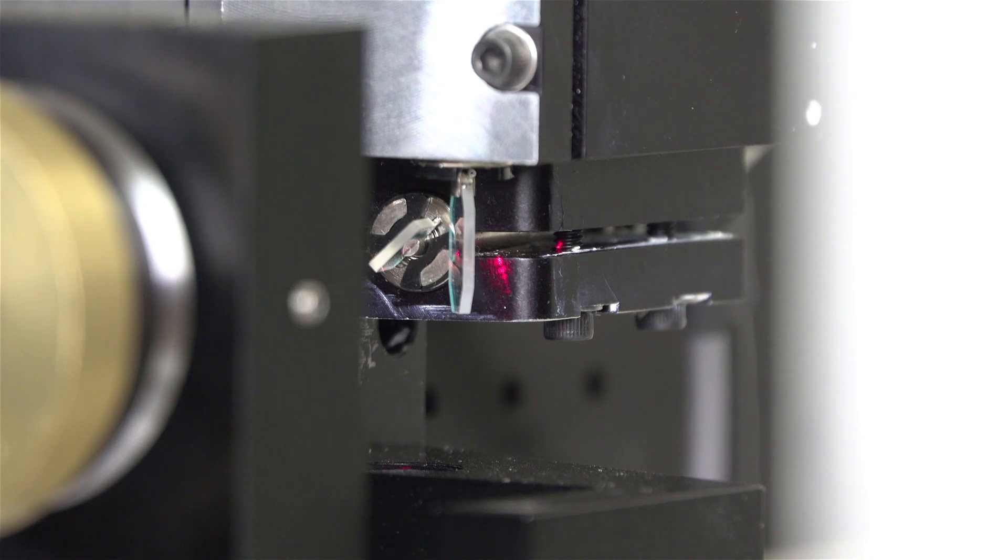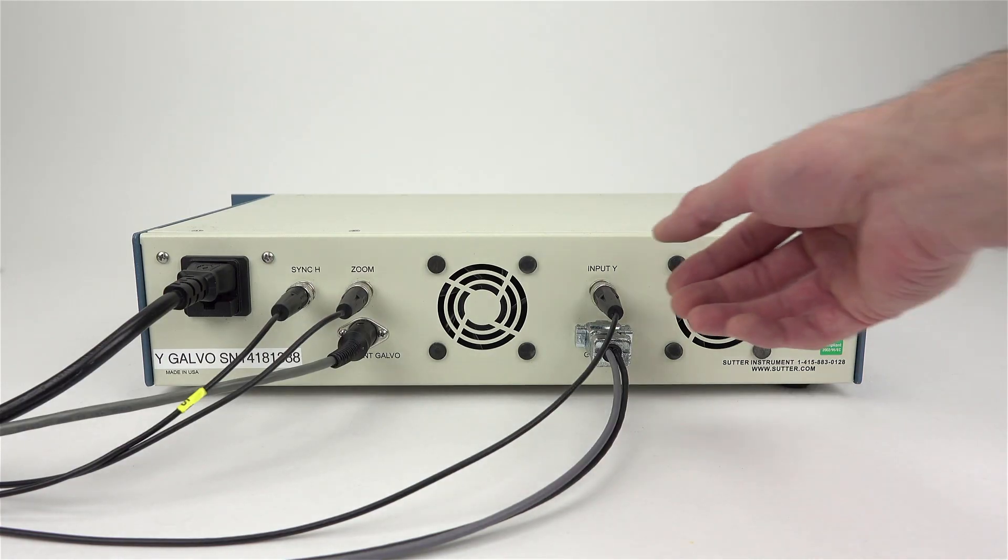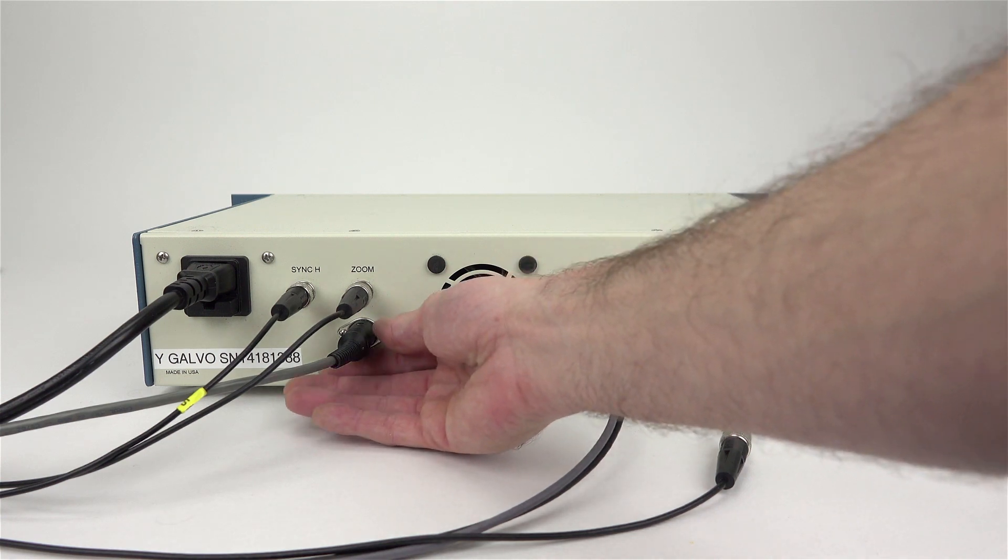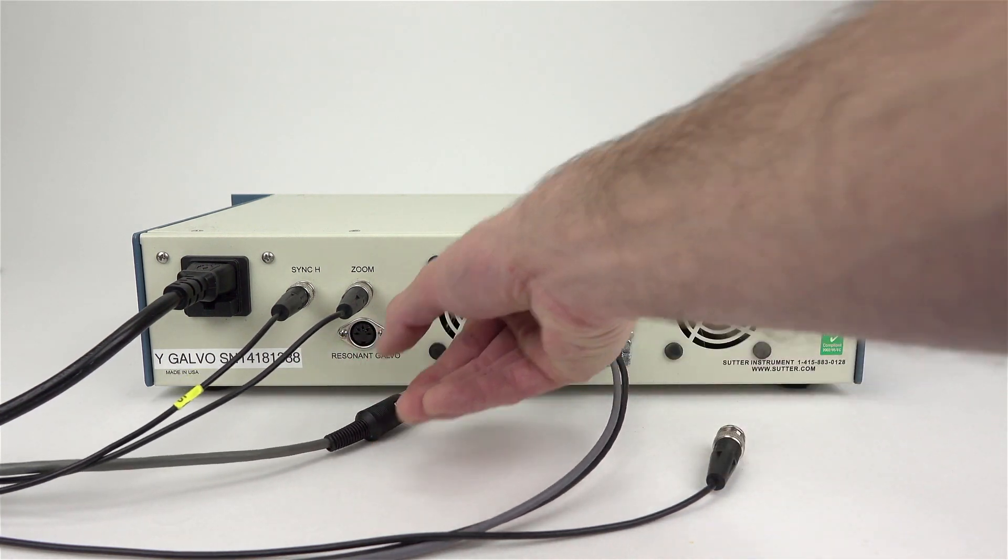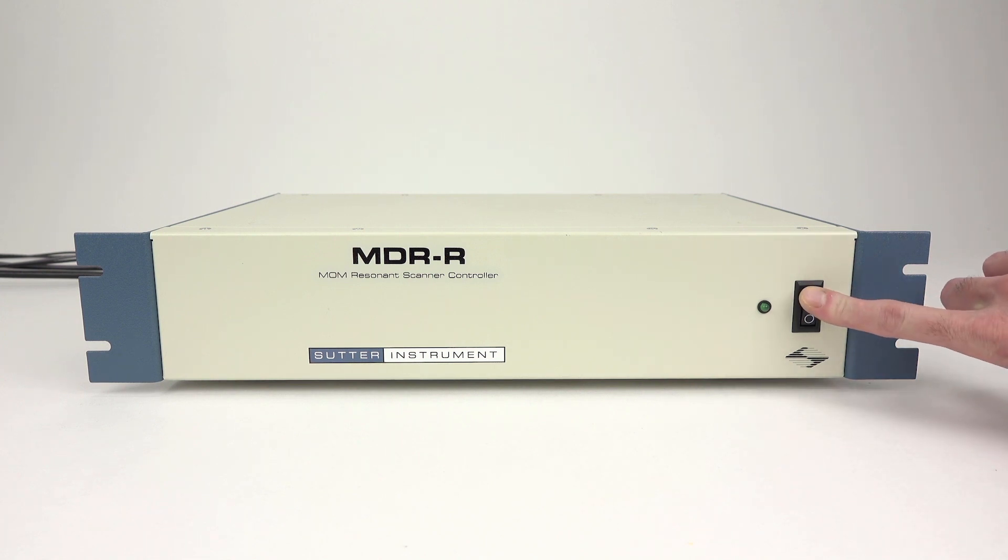For resonant scanners, also start with the controller powered off. On the back of the MDRR controller, unplug the Y BNC cable, then additionally unplug the resonant scanner cable from the back of the controller. Then power it up, and the scanners should jump to their centered position, about one second after flipping the switch back on.